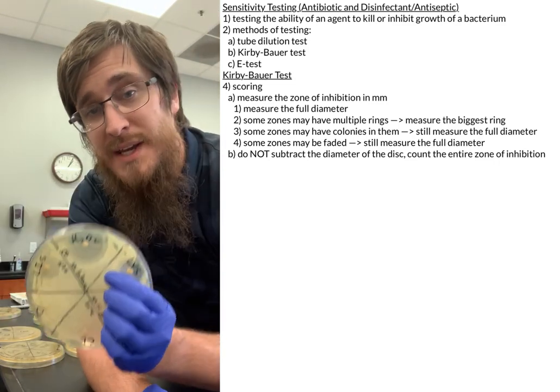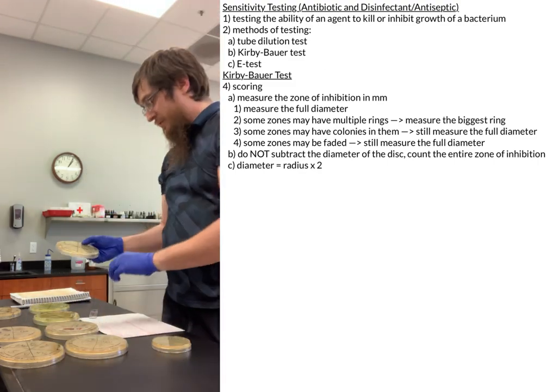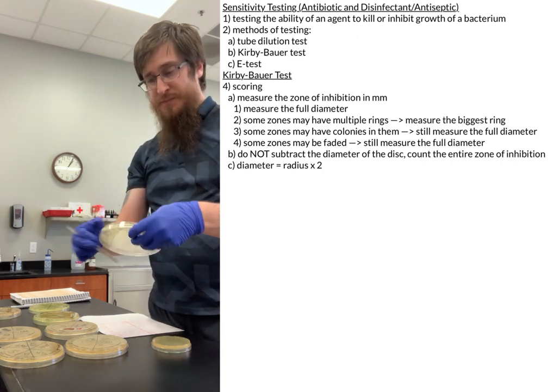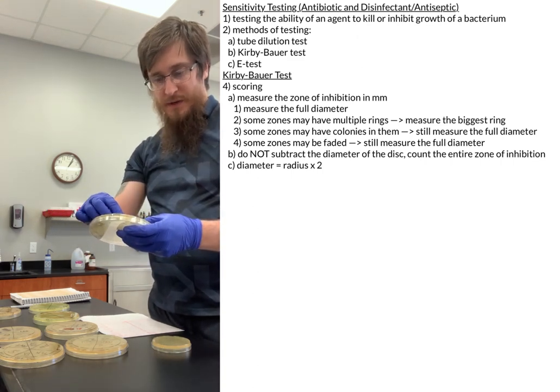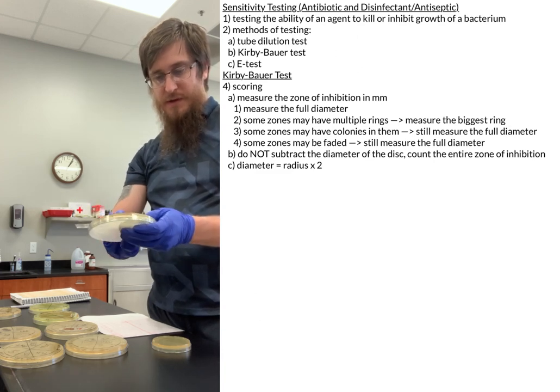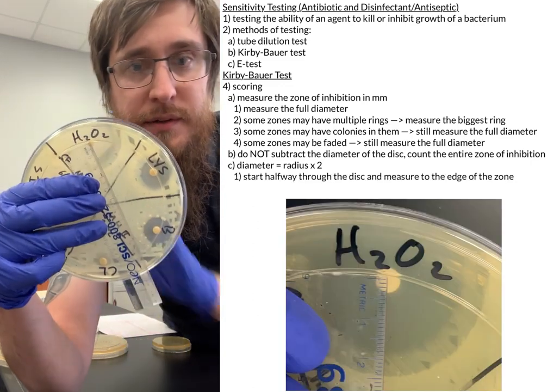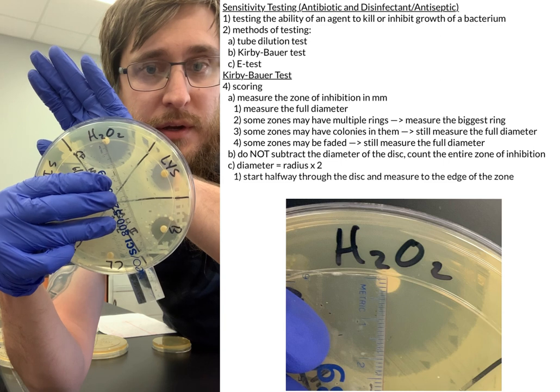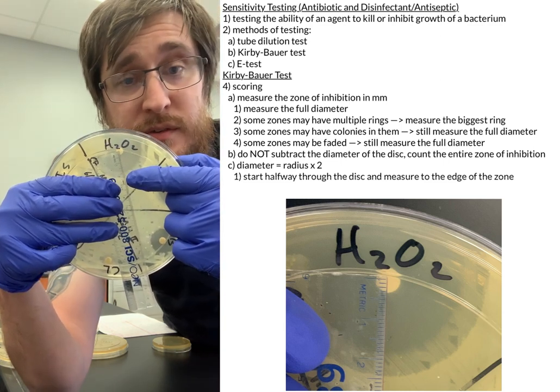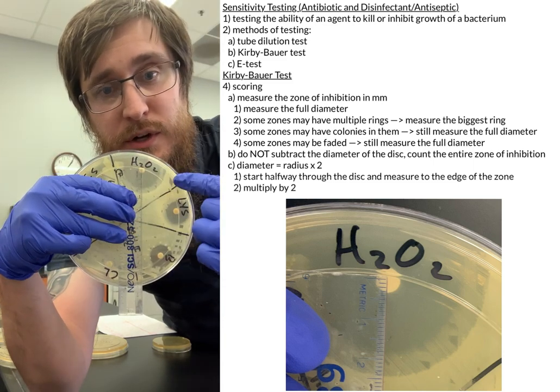So remember, diameter is simply a radius multiplied by 2. So if I want to calculate out my diameter, but I don't have a full diameter, I can just take my ruler, put it about halfway across my disc, and then I can go out, see if I can put my hand up, there we go. And now what I would do is I would just measure down my radius, that's about 25, and then I would just multiply 25 by 2 to get the 50 that I got when I went across the full diameter.